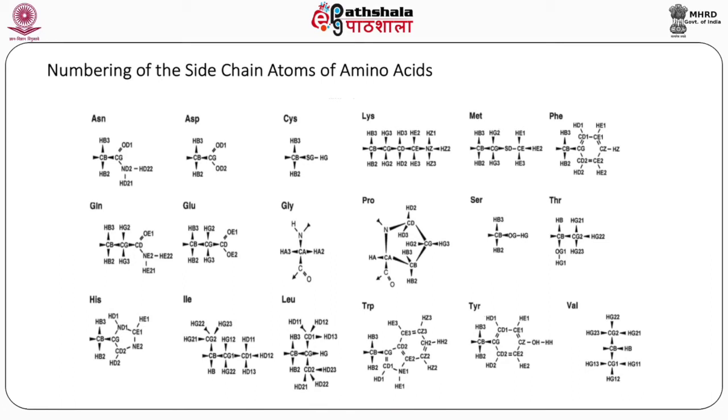In our previous module, we have learnt about the experiments that provide backbone resonance assignment through sequential walk. Now let us look at the side chain atoms of amino acids. These are taken from the Cyana library, and in this the various amino acid structures are shown and the specific labeling for their atoms are also given. Let us look at some of them.